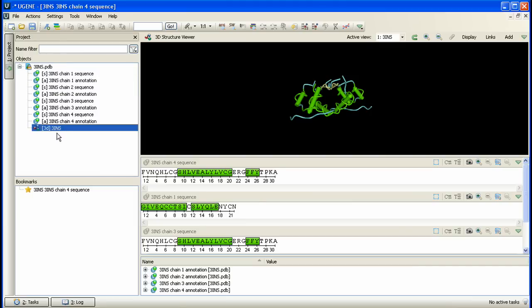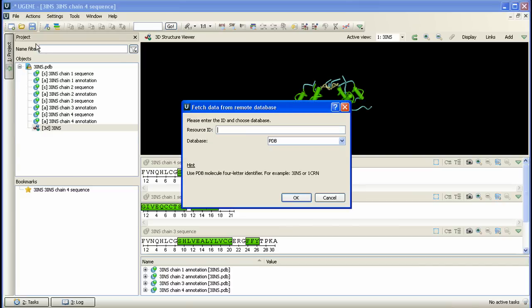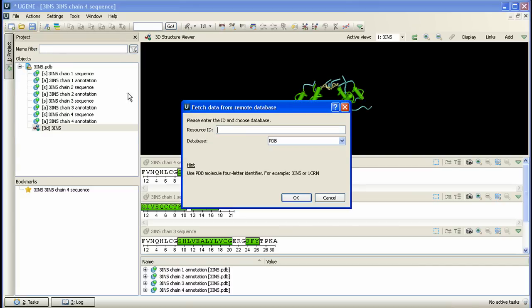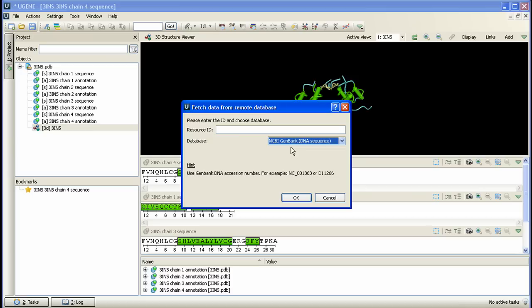Let's open one more document from another database. We activate File, Access Remote Database menu items and this time select NCBI GenBank database. We will open one really well-known gene, Influenza A virus or H1N1.